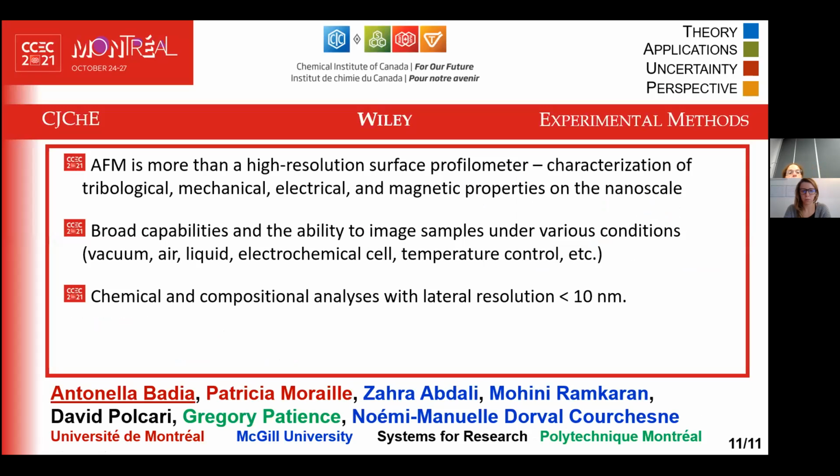So in conclusion, I hope that I've convinced you that AFM is more than just a high resolution surface profilometer. It enables the characterization of tribological, mechanical, electrical, and magnetic properties on the nanoscale. It has broad capabilities and the ability to image samples under various conditions, including electrochemical environments and under temperature control.